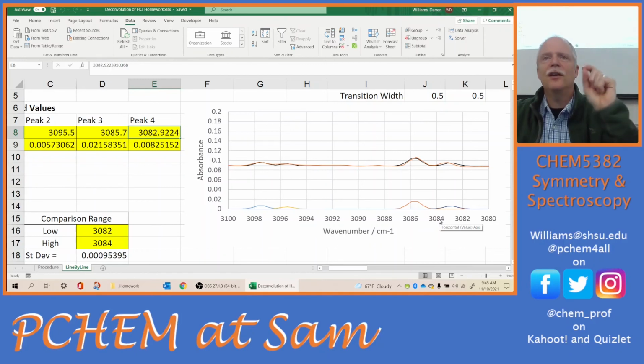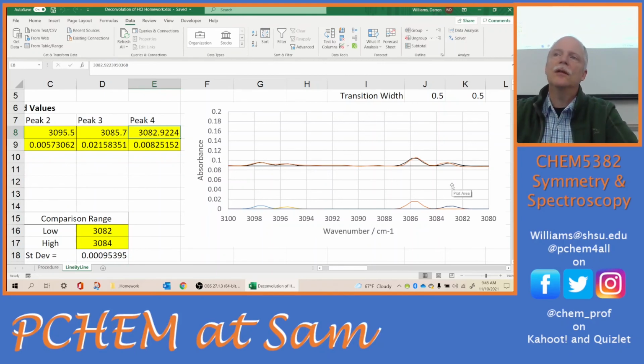You do your best on all your peaks, and then we'll have, again, our best assignment of this spectrum that's possible, because it will be even between our data points. Notice there is no data point at that value. So we're getting a peak center at a higher resolution than our spectrometer can deliver, by using all of the data in the plot. That's the strength of deconvolution: we use all of the data points across the whole peak to give us the peak center and the peak height, instead of just the maximum data point on the peak in the experimental spectrum.